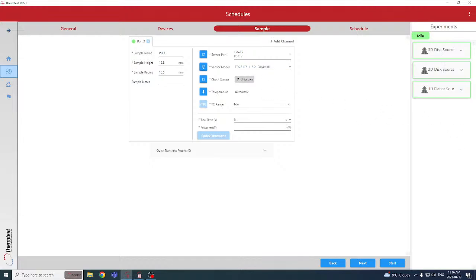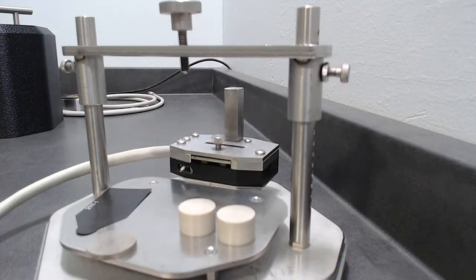As of right now, there's no sensor connected. So you should see this is the second sample holder that's connected into port 2. I think actually it's port 4. Yeah, that's the room temperature. Otherwise, it's the temperature platform. So they're labeled correctly. It's just me not paying attention. So port 4. So let's go to that camera and set up.